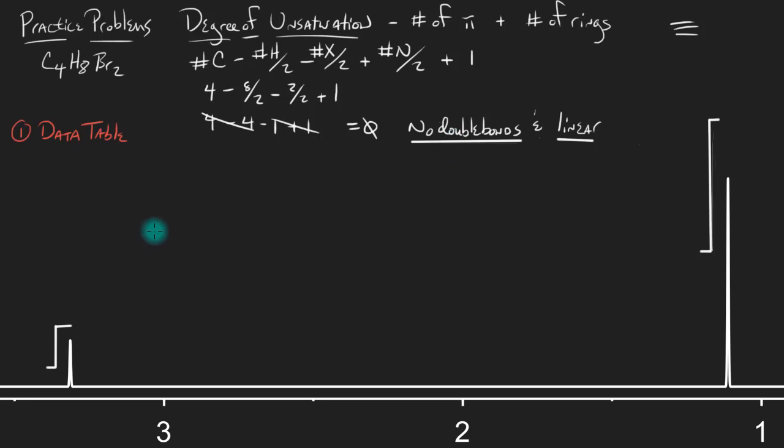And this is the first thing I would always suggest to do right at the very beginning before you do anything else. If you're given the molecular formula, go ahead, calculate the degree of unsaturation, and figure out what kind of generalized features you can have for your molecule. After that, I actually have kind of a 4 to 5 part process that I try to follow whenever I'm trying to solve these types of problems. So I'm going to introduce you to my problem solving method, and if you like it, wonderful. You don't have to use this problem solving method, but I find it very helpful.